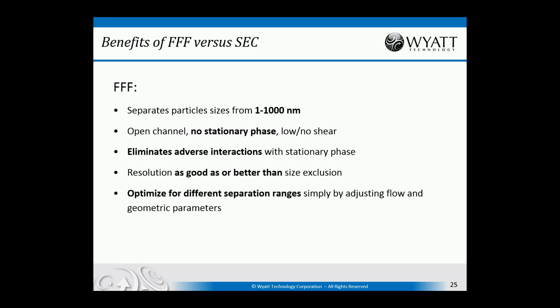And one of the really nice things about FFF is that you can optimize the separation for different ranges simply by adjusting flow and geometric parameters. And you can even do this on the fly. So you can set it up to separate over a very large range, or you can set it up to zoom in and give you high resolution in a particular size range, and then on the fly you can change it to give you high resolution in a different size range. And so it's very versatile in that respect.